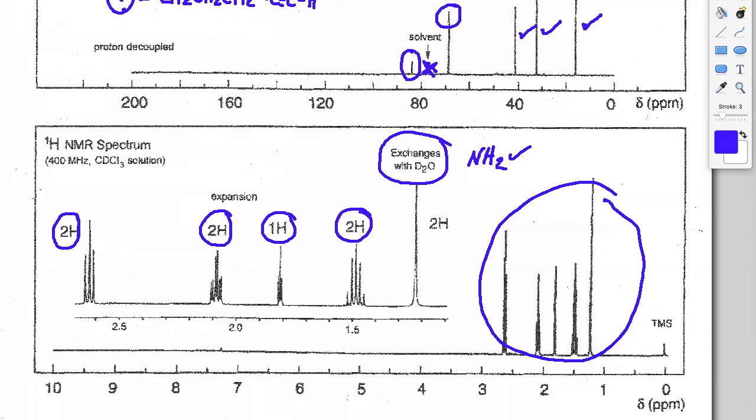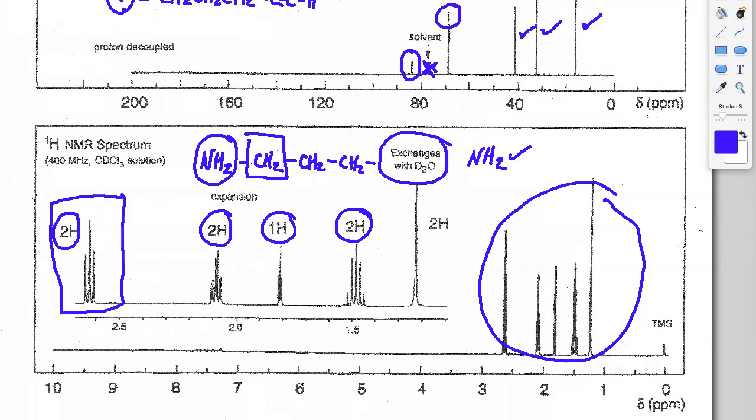The splitting here can get a little hairy when we have all of the CH2s, but if we take a look, I've got an NH2 and a CH2, a CH2, another CH2, and then the alkyne. So this NH2 would certainly have the electron withdrawing effects that are going to be seen in terms of de-shielding. And so it would make sense that this CH2 that I'm putting a square around right here correlates to this CH2 right here. And the neighboring CH2 would split it into a triplet.